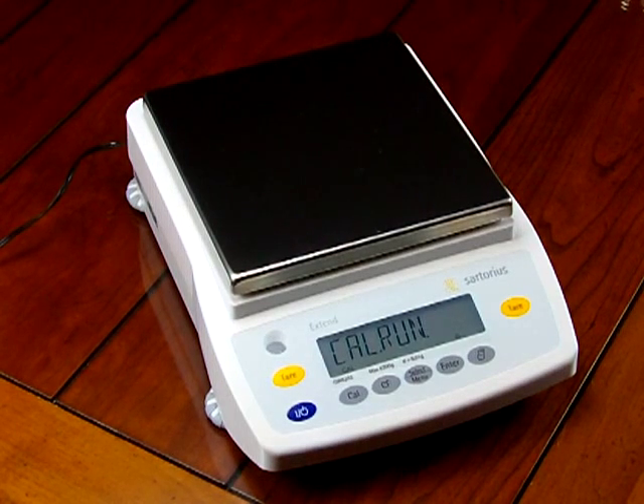The balance has the ability to weigh in up to 13 different weigh modes. With the GW series, you're able to scroll through five different weigh modes. Most Sartorius and competitive brands typically let you toggle between only two weigh units, but with the Sartorius GW series you can toggle between five different weigh modes if you set it up that way.